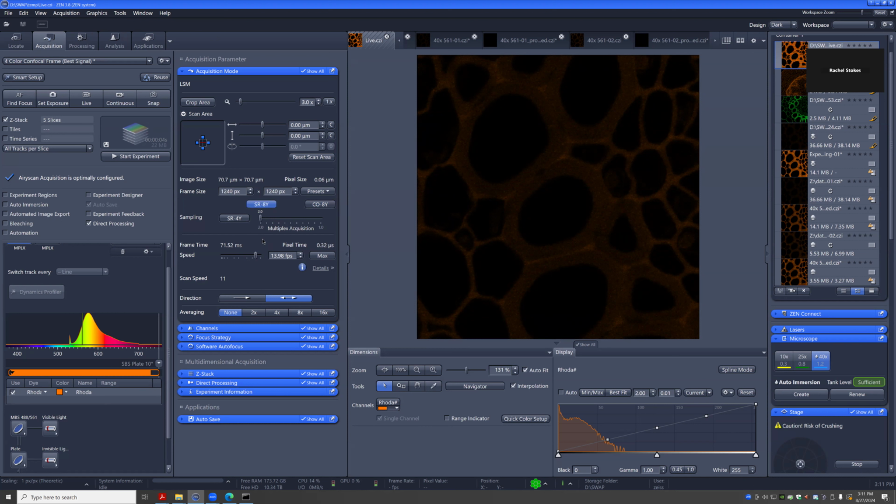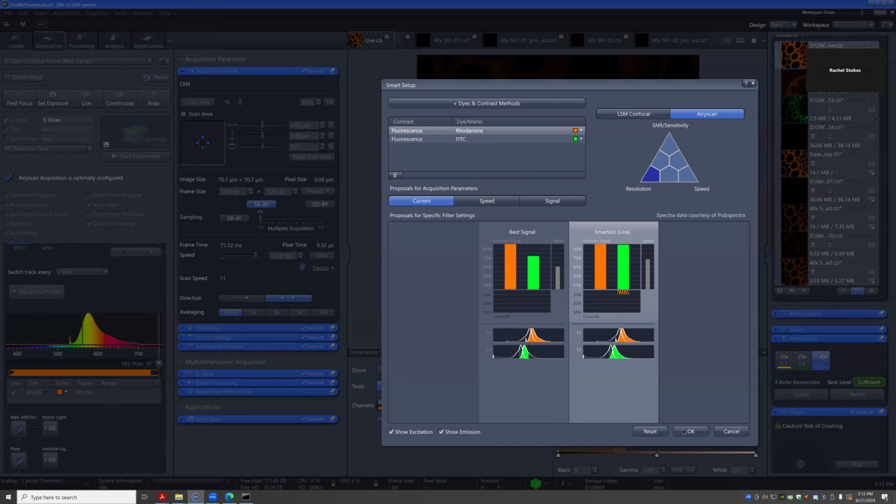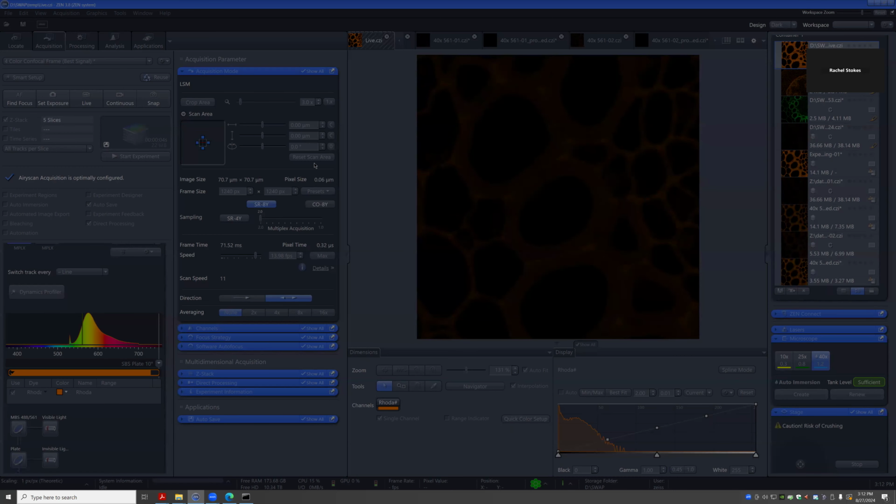You can actually hear inside the scan that you hear the optics changing. That's the beam shaper, shaping that beam onto the area scan detector to line it up for those 8 pixels simultaneous. Of course, none of that happens when you're in AiryScan SR mode. So if we go back, we pick this super resolution mode, switch here.